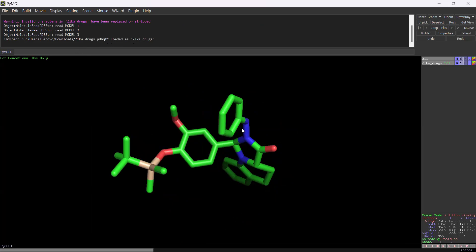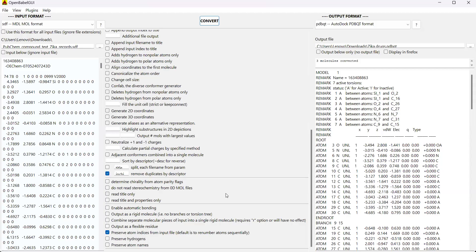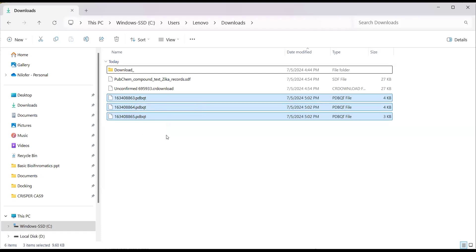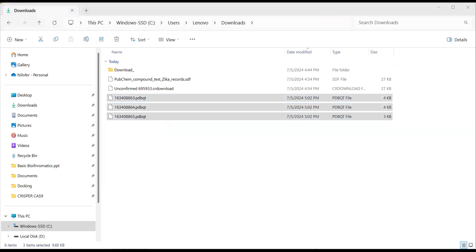Now I'm going to show you how, using OpenBabel again, you can convert one SDF file into multiple individual PDBQT file formats. As you can see, what we did previously is shown here. The next step is to click 'split each file by title' from the data options. If you run this and then click Convert, totally we have three molecules which are converted. Go into the downloads folder to check — you can see all three individual PDBQT drug files are there.